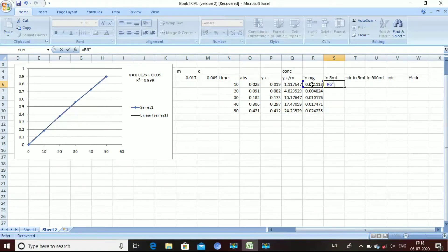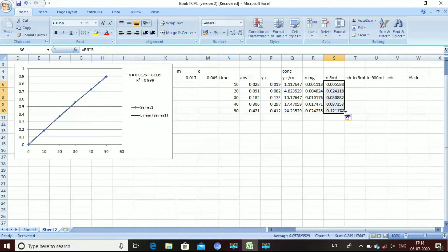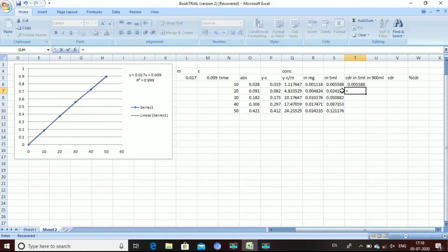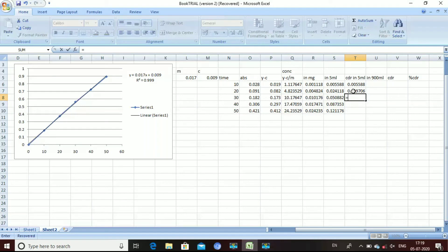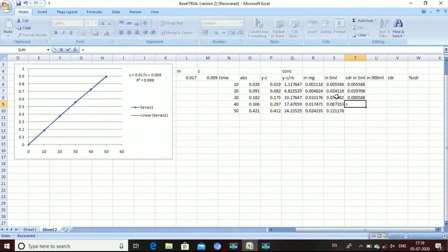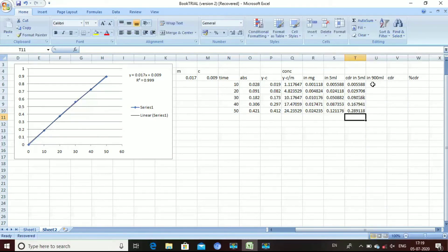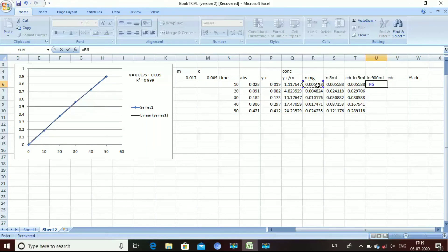We calculate the reading in 5 mL. The next column is cumulative release in 5 mL. For the first reading, it is the value in 5 mL itself. The second reading is the cumulative release in 5 mL plus the previous value, and the third value is equal to the current value plus the previous cumulative value. For the next column, cumulative release in 900 mL, we multiply the mg value by 900.